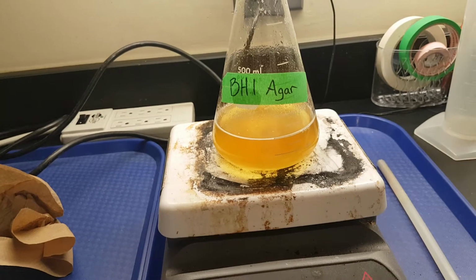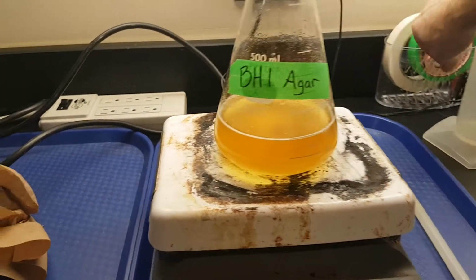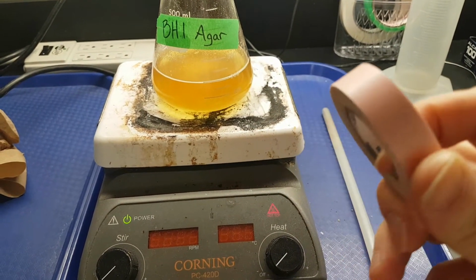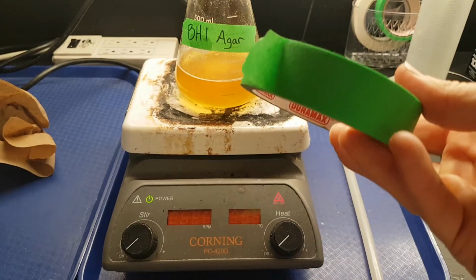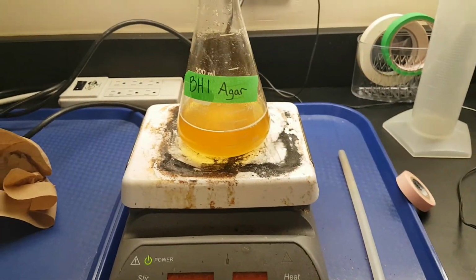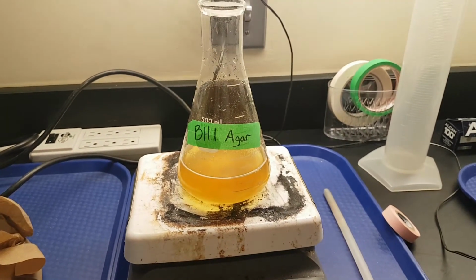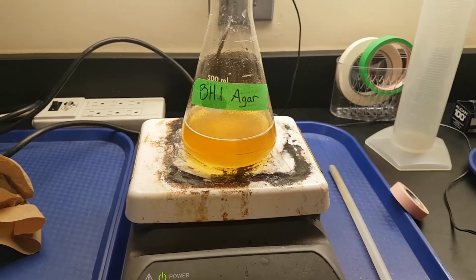There are different types of tape you can use. We used to use masking tape for everything. There's some science tape that you can use. This is made to come off of glassware easily and be pretty resilient. But honestly, I just prefer to use painter's tape from the dollar store. You get a whole bunch of it for not a lot. It comes off really nicely, doesn't stick. So that's what you'll have out. You just write your medium and your initials on there, because each of you is making your own, and you're good to go.